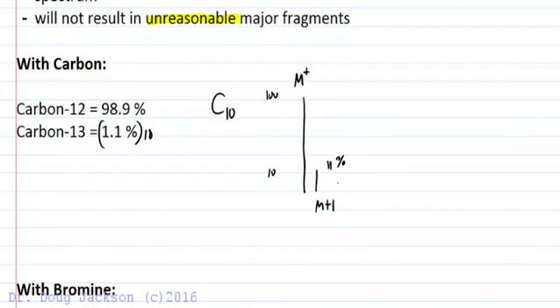And so if we think we have C10, and this was 10% and we have 100% here, but it's more than 11%, maybe 15% or more, then this is actually the molecular ion and not the previous peak. And so it's not due to isotope if it's greater than 11% with 10 carbons.